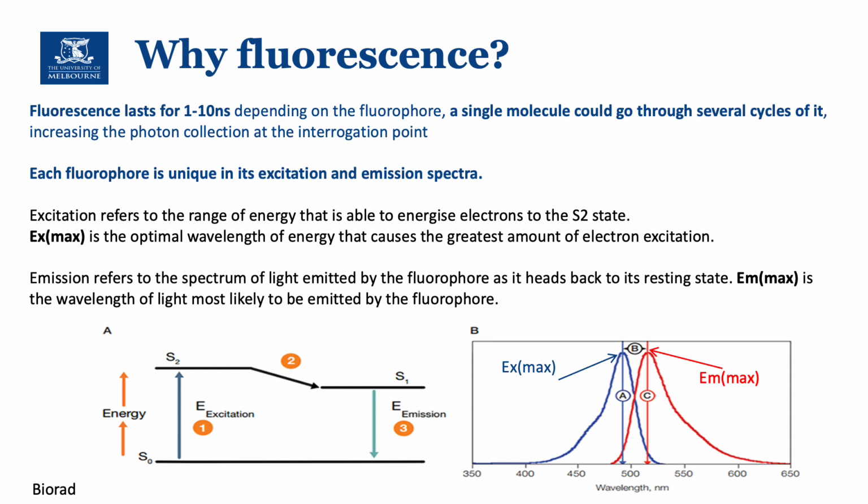But an important thing about understanding fluorescence is that there is an excitation maximum, which is the wavelength that most likely produces the biggest excitation of the dye, increasing the probability of excitation. And you also have the emission maximum, which is where the photons most likely will be produced, in terms of probabilistic emission. And there is a difference, of course, between the laser of excitation and the emission that you get. The difference here is the Stokes shift.